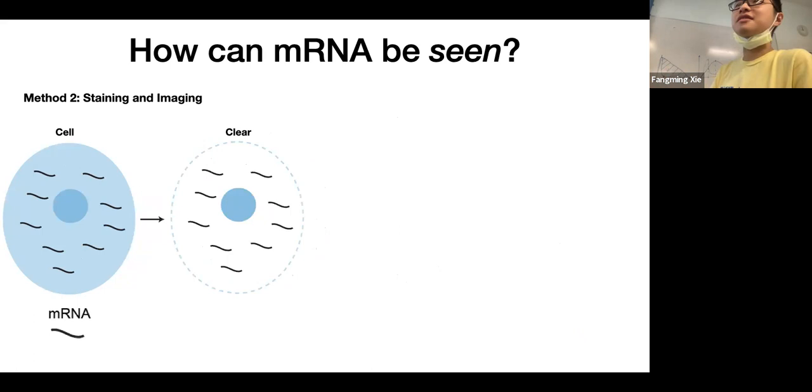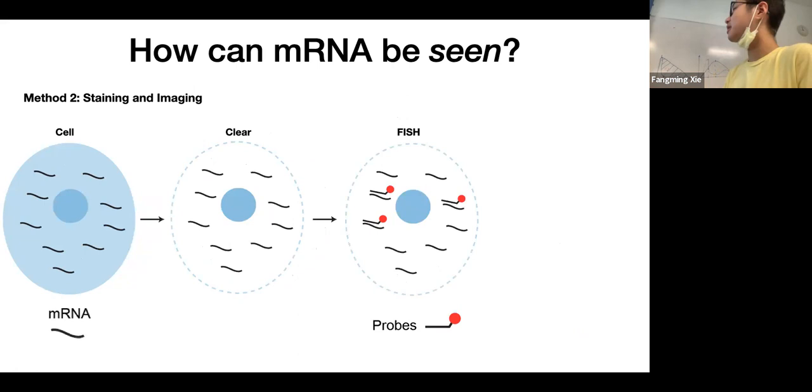And then we design specific probes that themselves are DNA sequences, short DNA oligos that carry a fluorophore, which can send off light when you use other exciting lights to excite it. It'll respond by sending light from themselves. And these probes are carefully designed in a specific sequence that selectively binds to certain kinds of mRNA molecules.